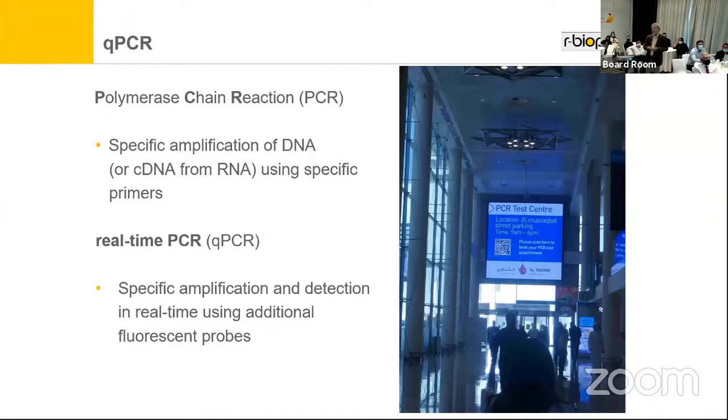And grown-ups will know PCR is a useful tool to detect the COVID-19 or SARS-CoV-2 virus, to get a certificate, having some CT values. This technology takes approximately 2 to 3 hours, depending on the samples, is a little bit more expensive than lateral flow, but is very specific and the gold standard for virus detection, detecting, for example, SARS-CoV-2 and not influenza.